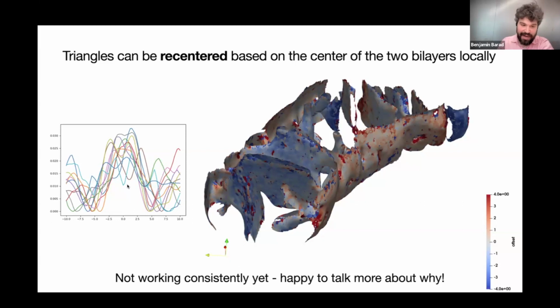Because if you're moving things by, on average, maybe 2 nanometers in each direction, that's quite a bit for something like surforama, where you're stepping out by maybe a few angstroms at a time, trying to find the plane where everything pops in together. So, this is stuff I'm really excited about. I think it's hopefully coming down the pipeline within the next few months. So as all of you that are learning about tomography now begin collecting your data, I hope that you'll keep in mind that these are the kinds of analyses that you can be doing with cellular tomography data.